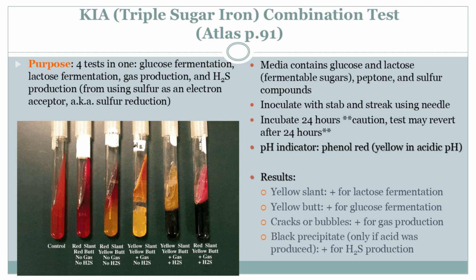Yeah. Like, why does this matter? Why does it matter? So one reason is because it can actually help us identify bacteria that are causing infections. Right. So we talked about that a little bit. Like if you go to the doctor and you have an infection, they need to figure out what it is. Exactly. So this is one of the tools they can use. It can help you differentiate between different types of bacteria based on their metabolic profile. So it's like another clue. Another clue. In our detective case.